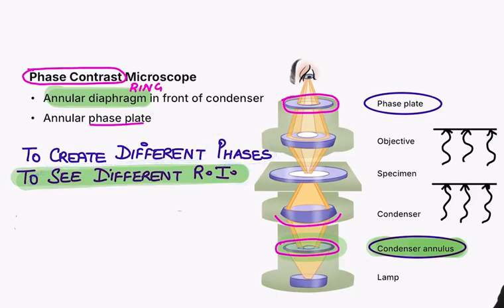Just giving you a slight overview of what happens from a physics point of view: initially, when you switched on the light, can you see that when the light waves have started going on, all the light waves are in the same phase, because if you see the waves, they are all coming parallel, they are all in the same phase. So I'll repeat it once again.